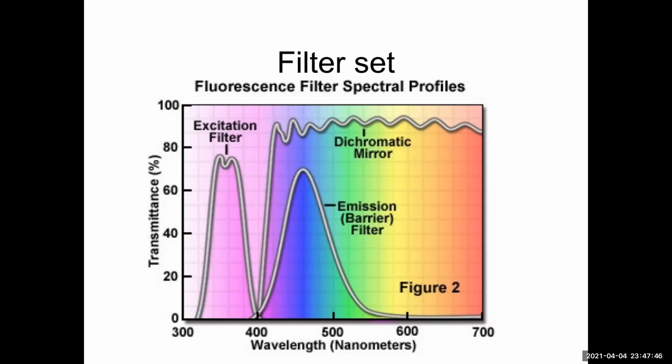Let's say I'm looking for a stain for COVID virus, SARS-CoV-2, with fluorescence: is it there or is it not there? So you can ask all sorts of different questions using fluorescence, but usually you're just saying, does it exist? And if so, where is it?